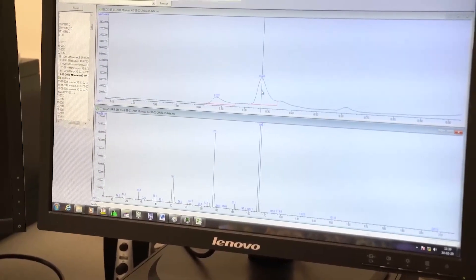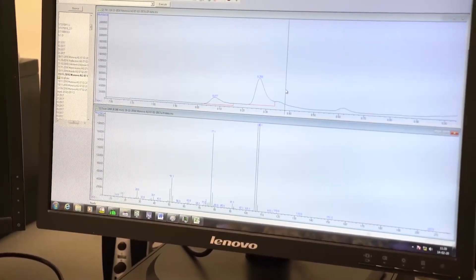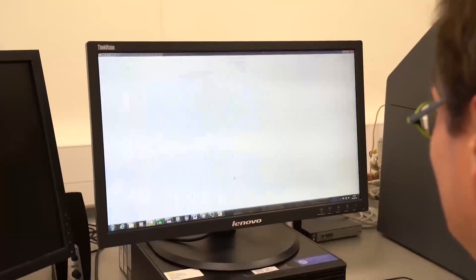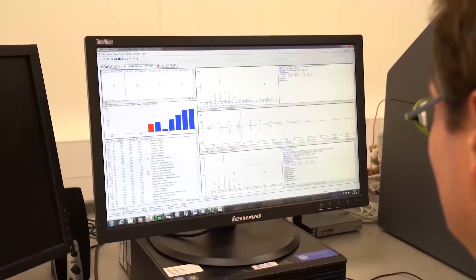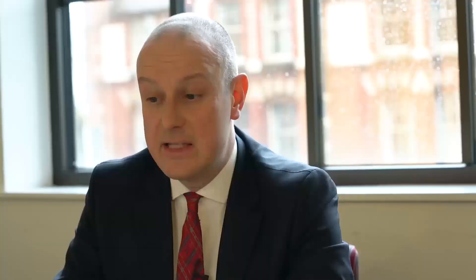For our current methodology here in Wolverhampton, we have adopted the technique of headspace solid phase microextraction, coupled with gas chromatography mass spectrometry, building upon and enhancing the methodology used in the past.